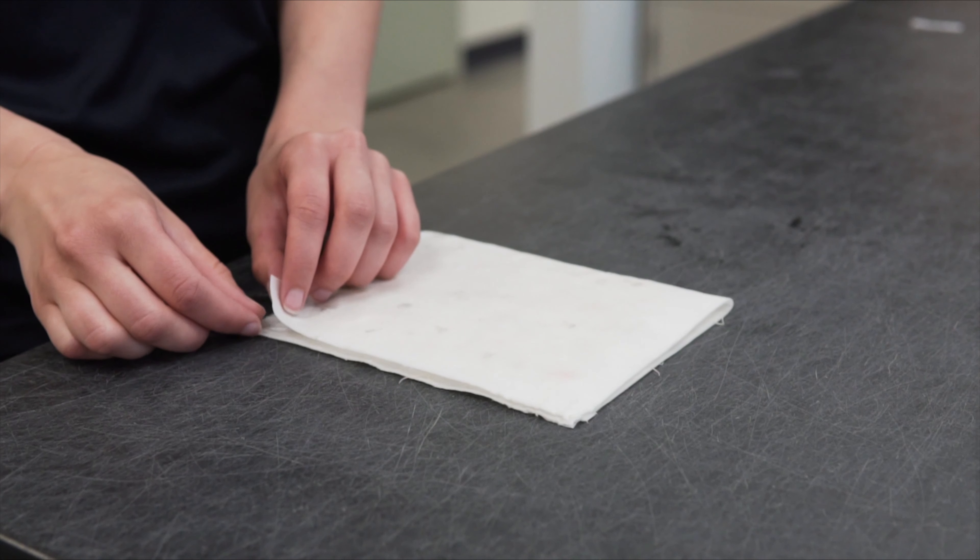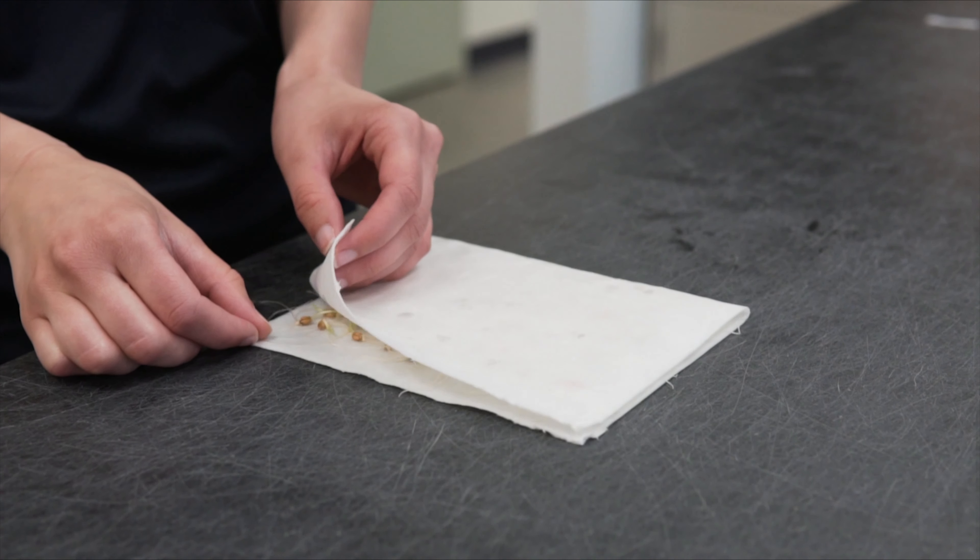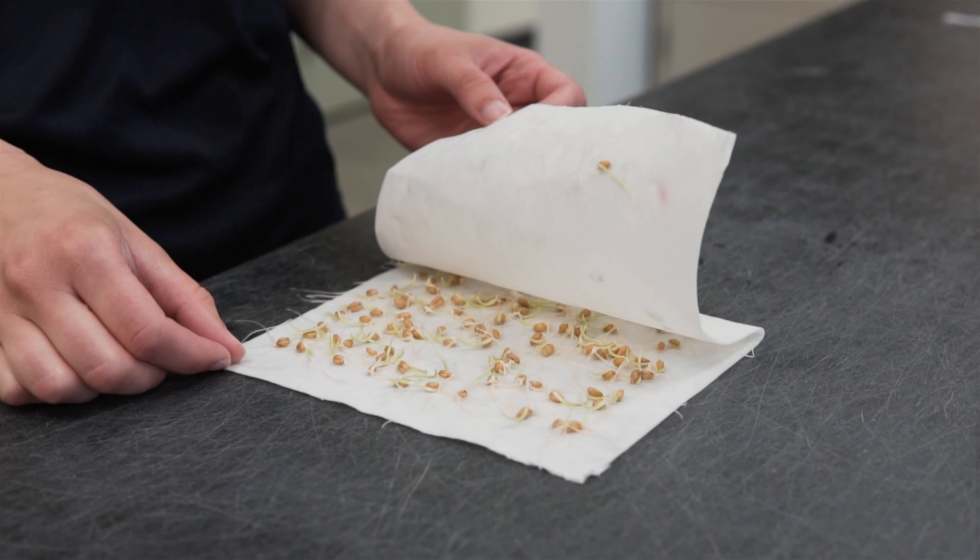Knowing your seed is the key to unlocking its potential. At 2020 Seed Labs, our team is dedicated to making that happen.